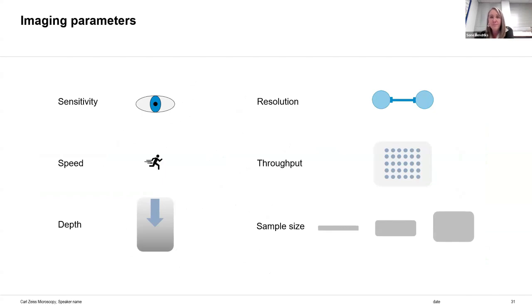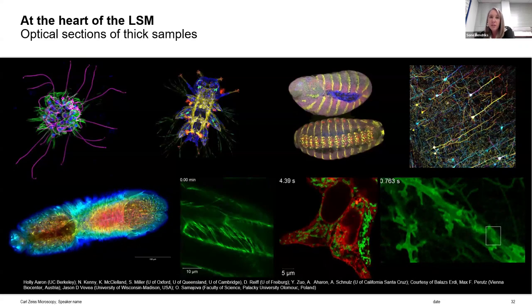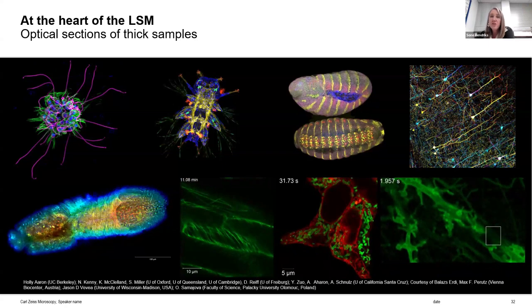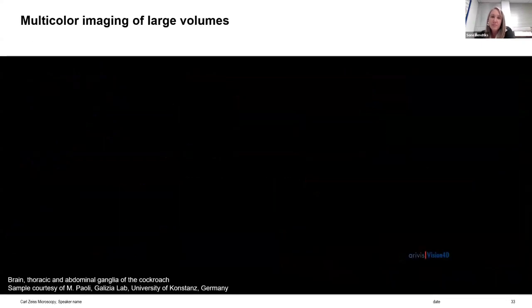For our next sample, let's consider something thicker, such as a whole brain or a whole zebrafish, with optical sectioning and the needs for great sensitivity, or possibly even looking at multiple fluorophores at a reasonably high speed. This parameter combination will strongly support the use of confocal microscopy, which is one of the most versatile imaging platforms available. Confocal microscopy allows you to optically section thick samples, separate multiple fluorophores, and do photomanipulation experiments.